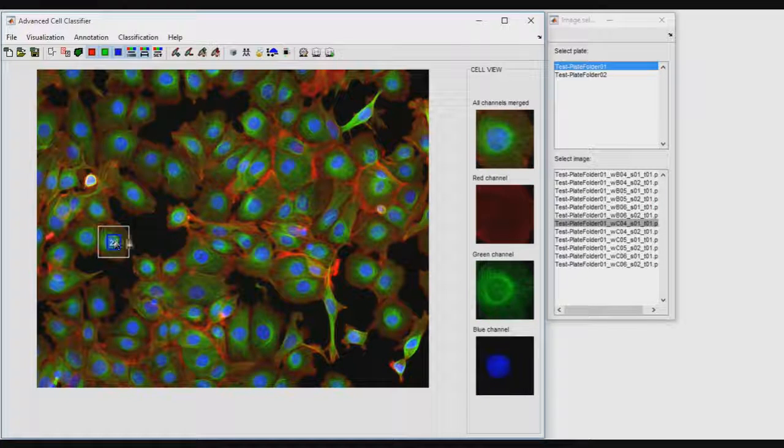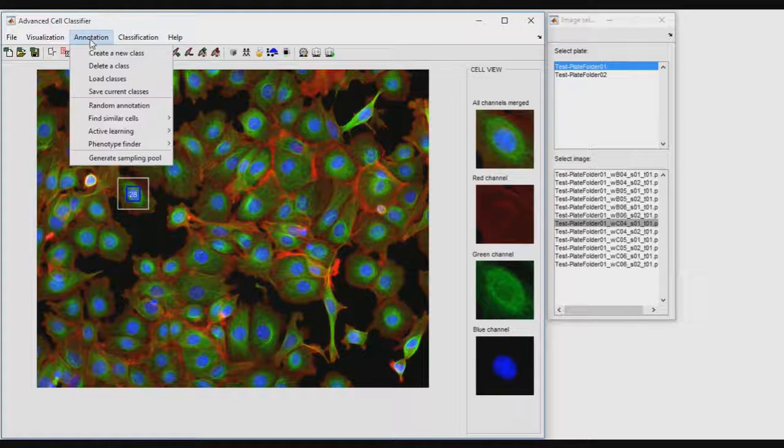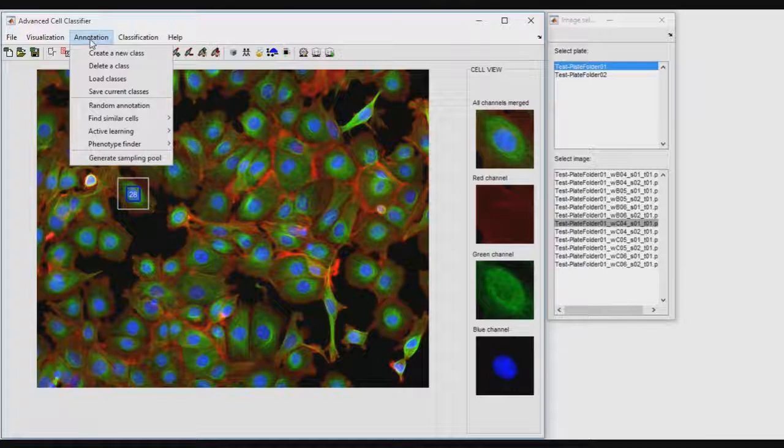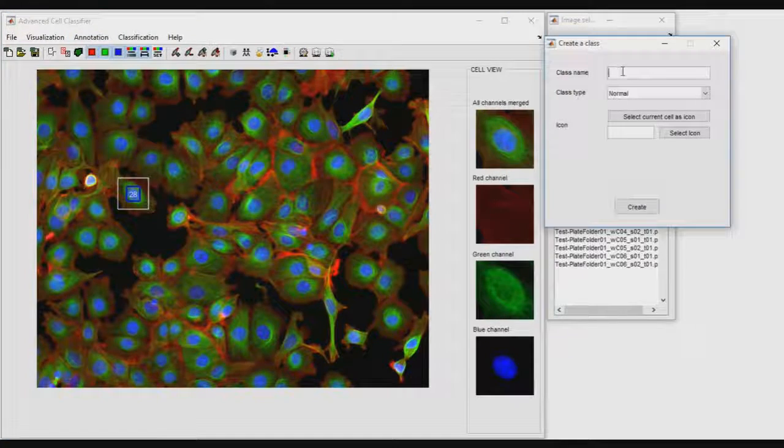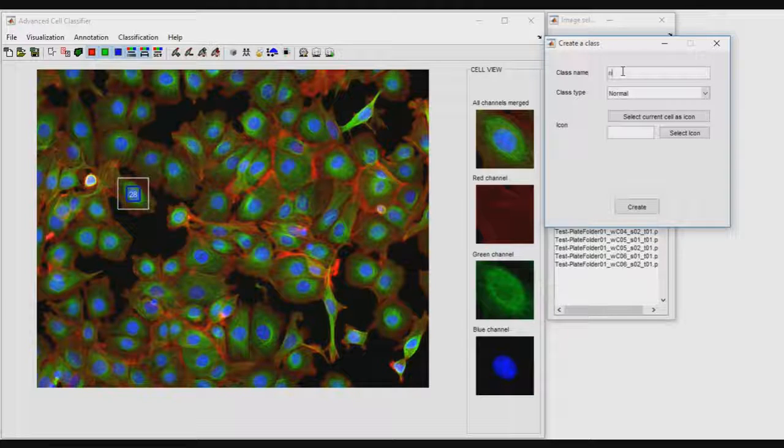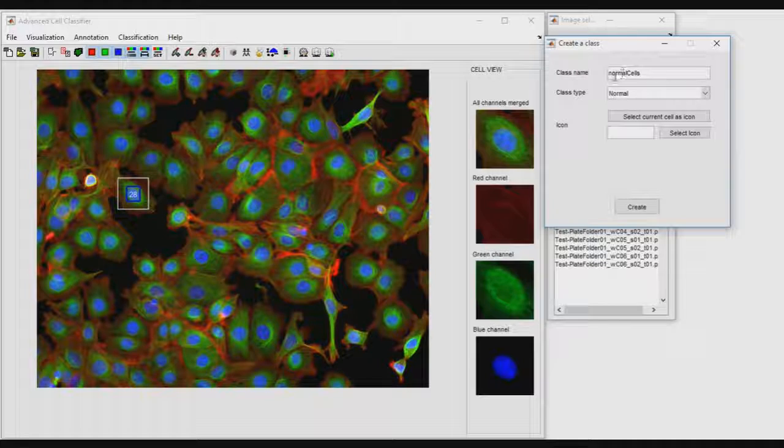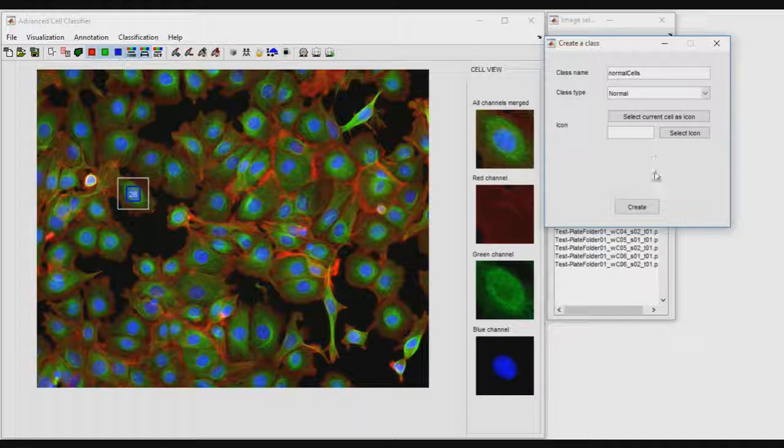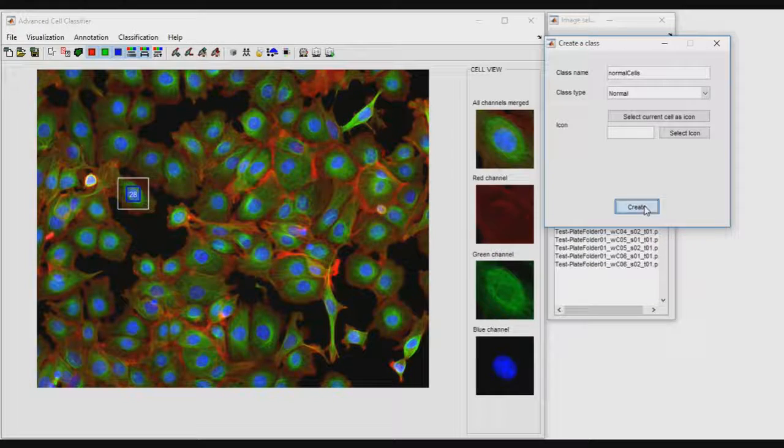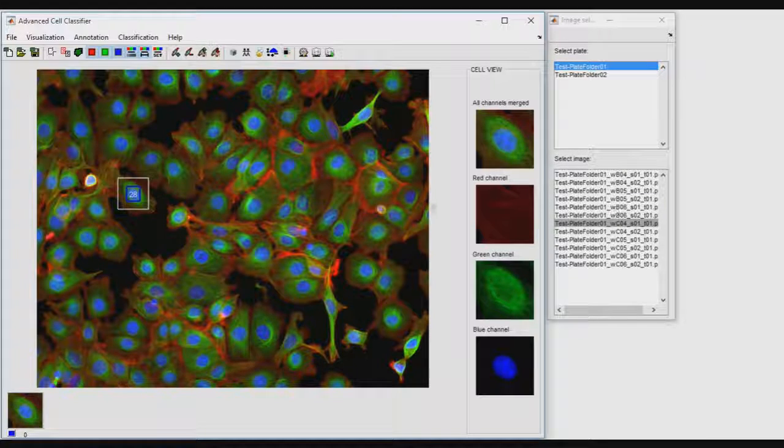To create classes of interest, users may select a cell and then click on Annotation - Create a new class. An icon representing the class will appear in the left-bottom corner of the main window.